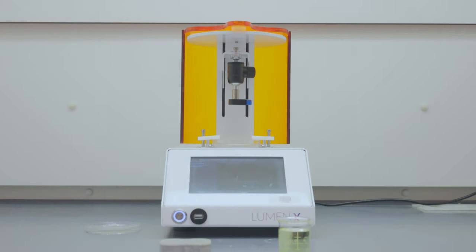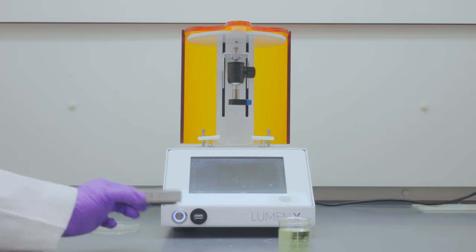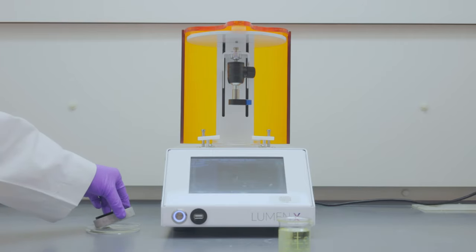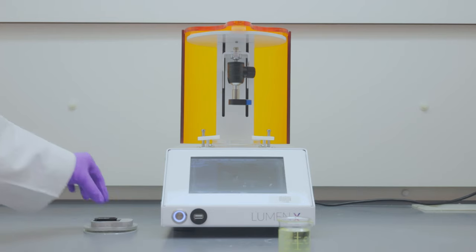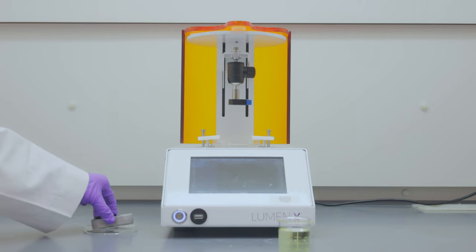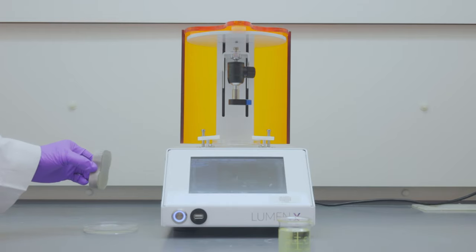After removing the printed object from the build platform, clean the build platform using DI water or 70% ethanol. To sterilize the build platform, soak it in 70% ethanol for 30 minutes and let it air dry. Now dry the surface of the build platform using paper towel.